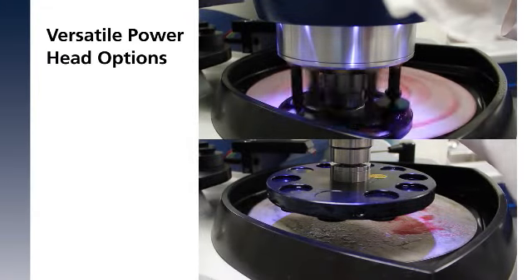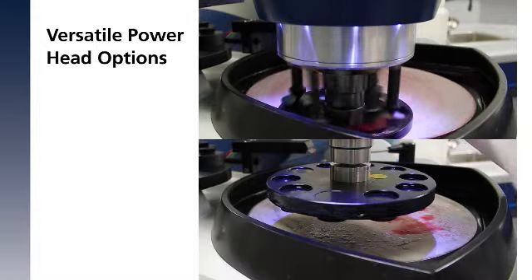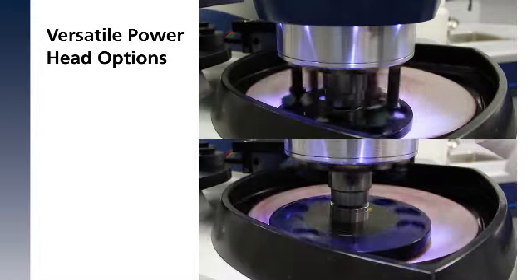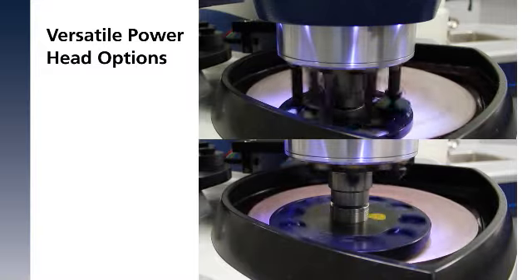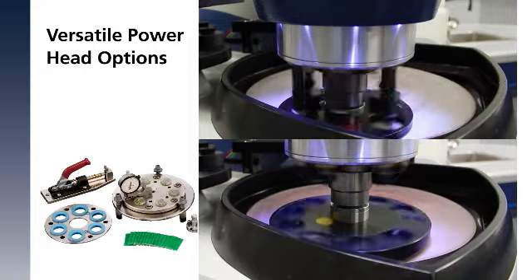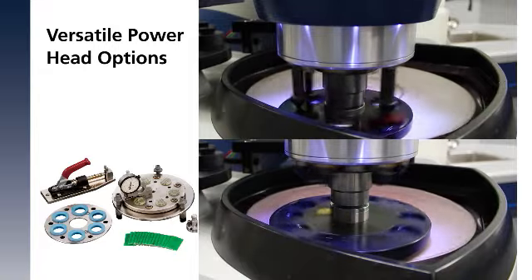Further tailor the unit with a variable speed Automat 250 or 300 powerhead. Both accept single and central force holders, as well as specialty accessories for targeted grinding or glass slide holders.